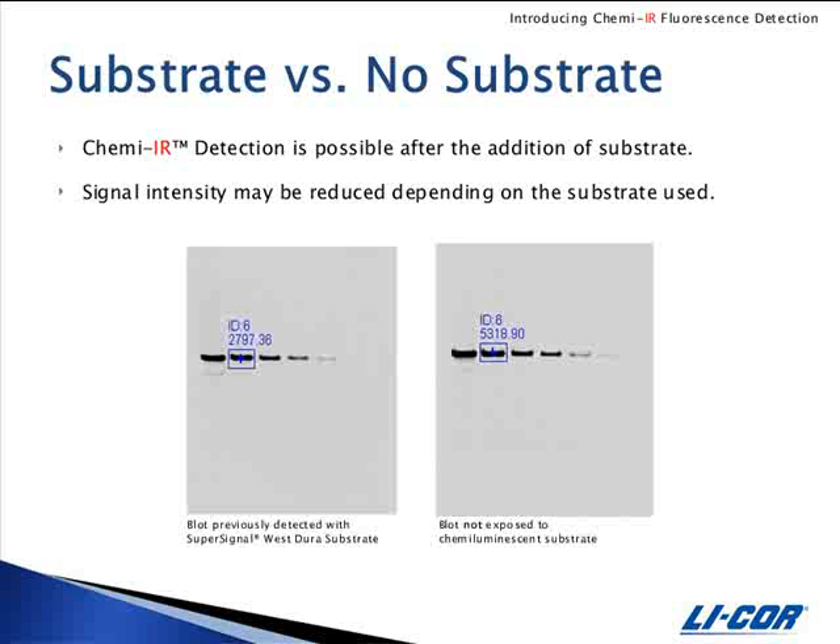These are replicate blots of serial diluted lysate that were probed and detected with the same antibodies. The blot on the left was exposed to ChemE substrate for approximately an hour prior to ChemEIR detection, and the blot on the right was not. The band selected here is twice as intense on the blot that was not exposed to substrate.